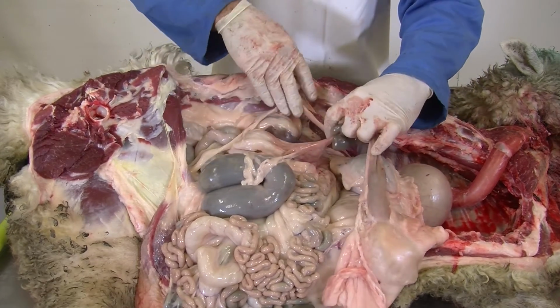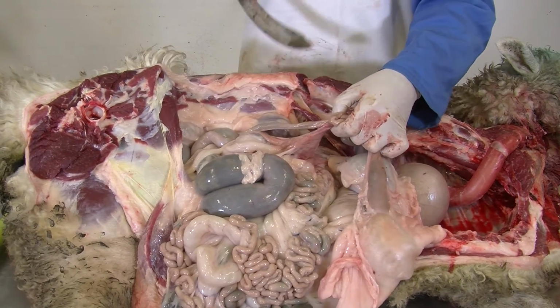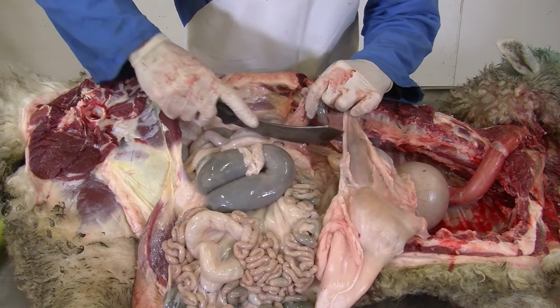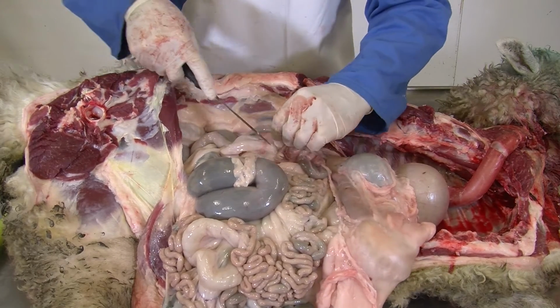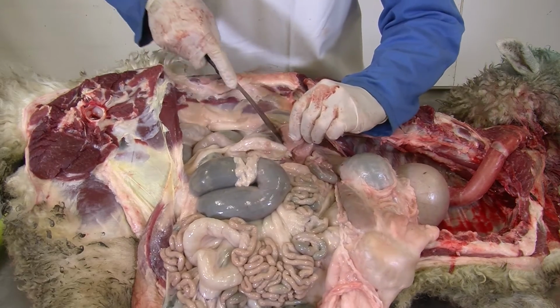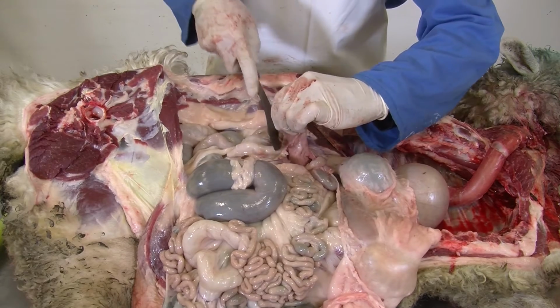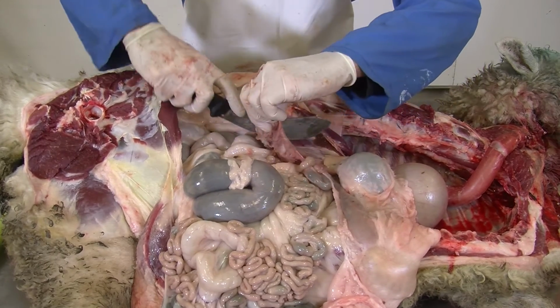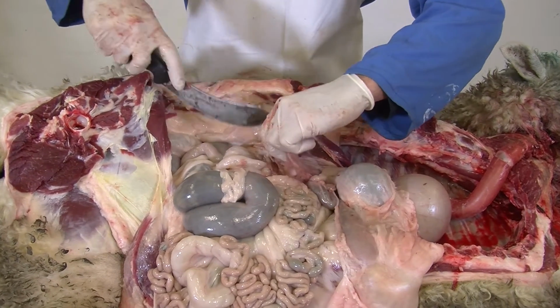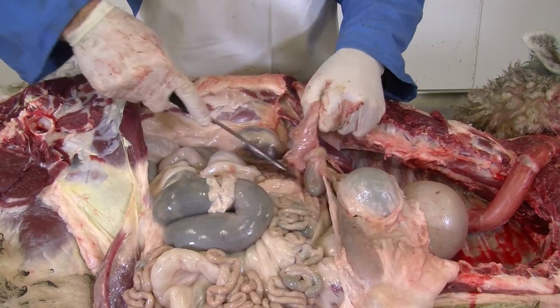Just going to, you can see how here the pancreas attaches to it. So I'm just going to remove the pancreas. It's quite a diffuse sort of structure. It's just sort of attached to a membrane here. I'm not going to get all of it.